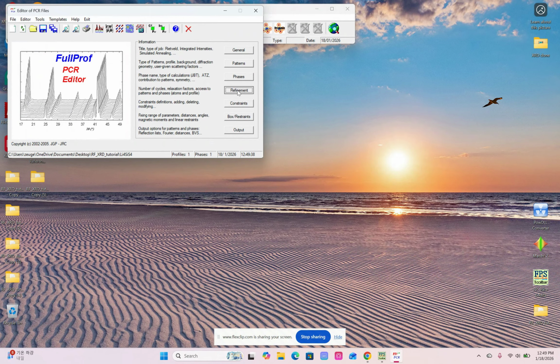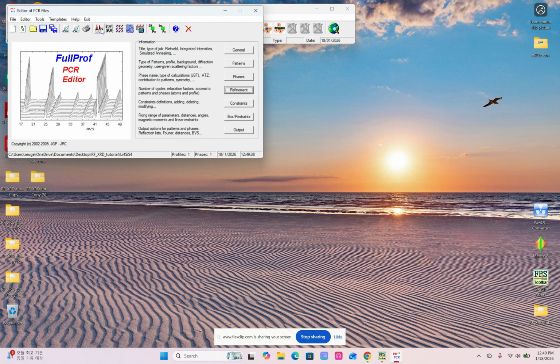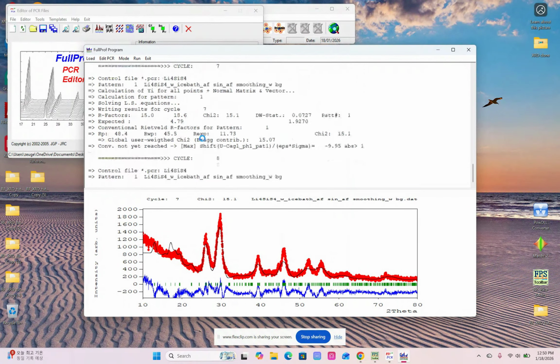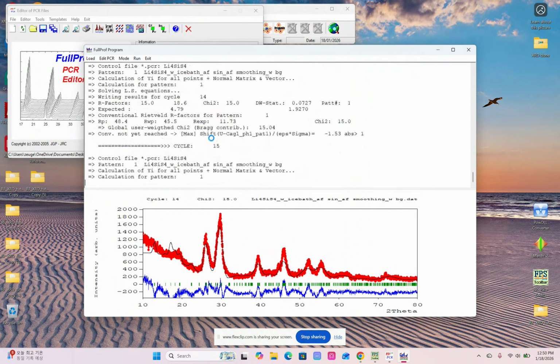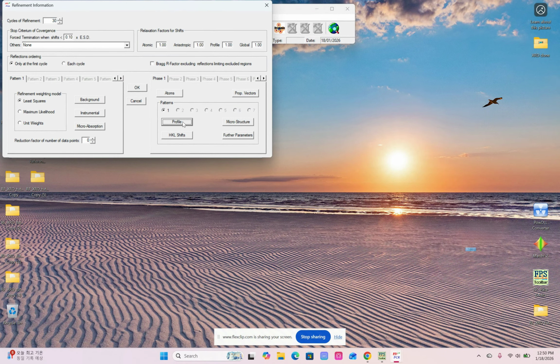Okay. At this point, I would still say it's smart to do it one by one. And later on, we're gonna combine the parameters. Okay. Next.